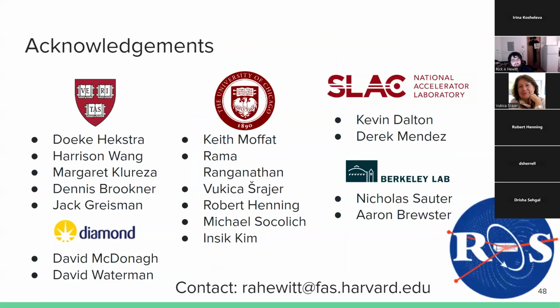And then just acknowledgements. These people have all been pretty instrumental in helping to build this software and make it a reality. At Harvard, of course, I'm in Doeke Hekstra's group. Several grad students, some graduated now, also helped with developing Laue-DIALS and applying it to data sets. Of course, we have our many DIALS collaborators at Diamond and Berkeley Lab and at SLAC. And then University of Chicago, specifically through BioCARS, has also been really helpful in providing data and support for building this software.